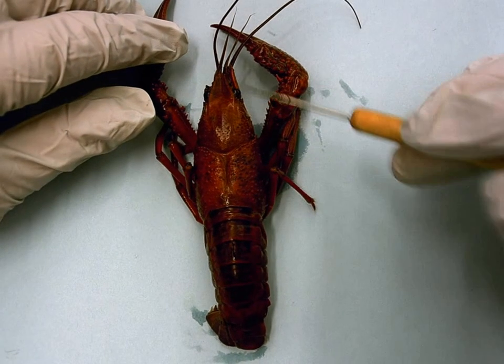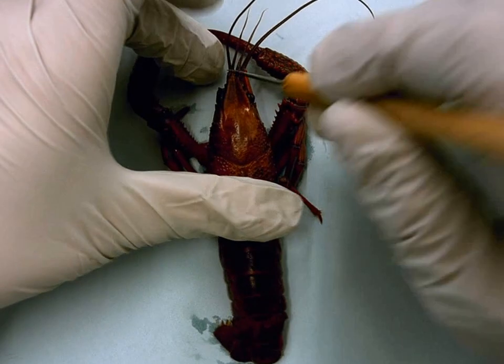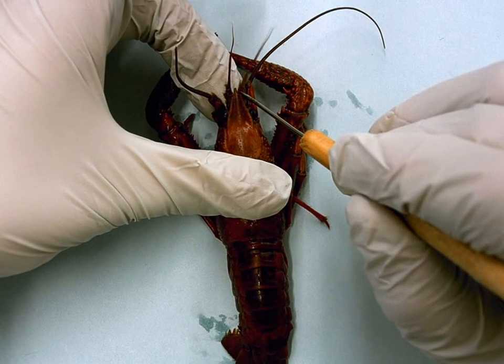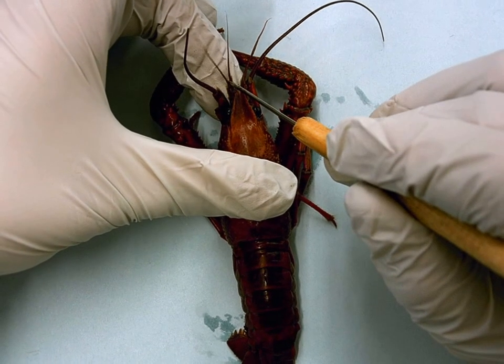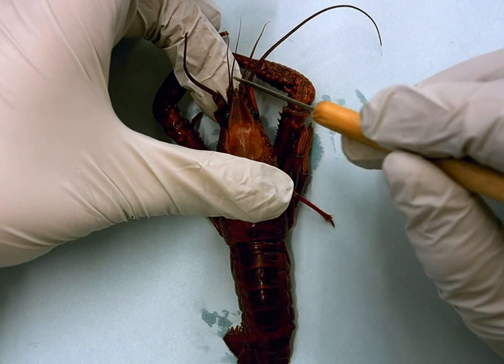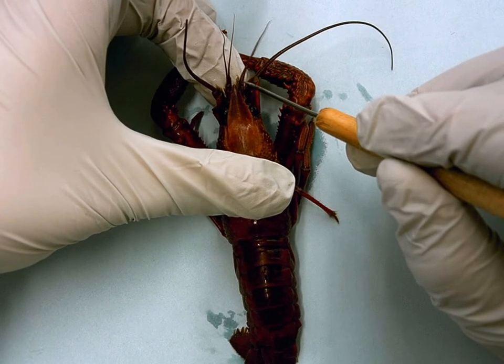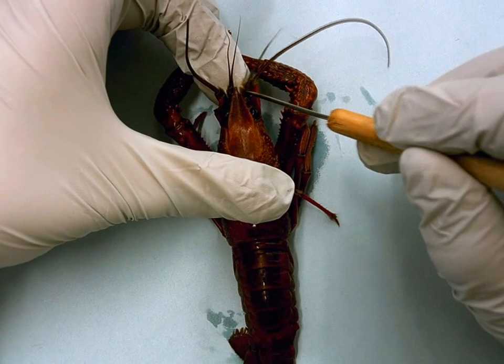Starting in the head region, it asks you to find the first antennae, which are called the antennules. Those would be these first two little extensions off the body — one antennule here and the other antennule here, coming off of pretty much one base.